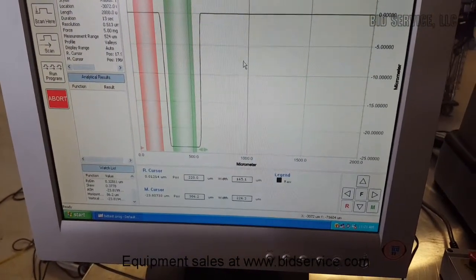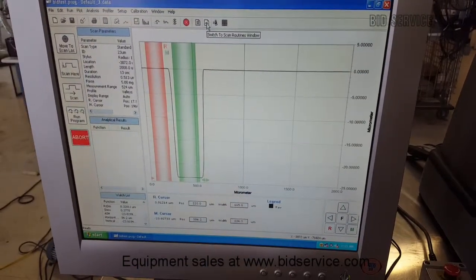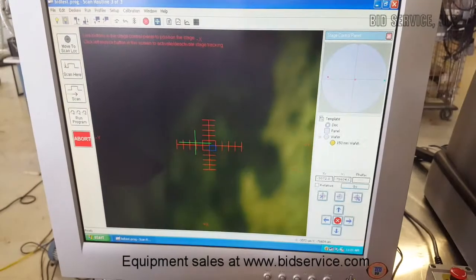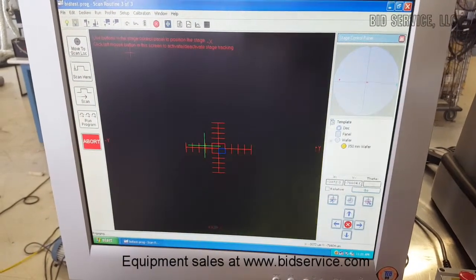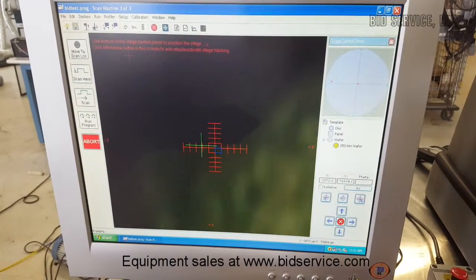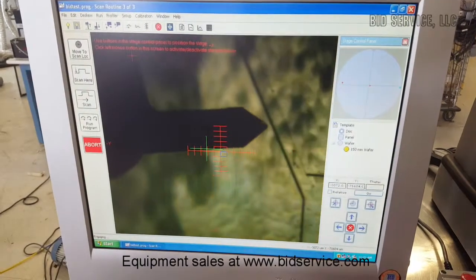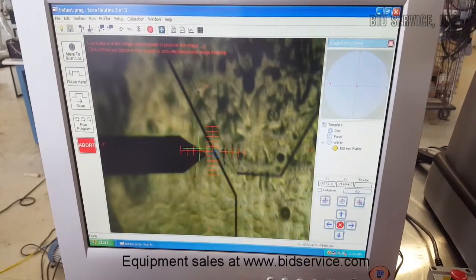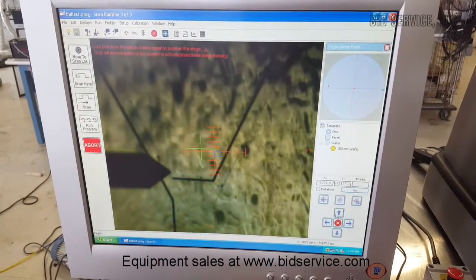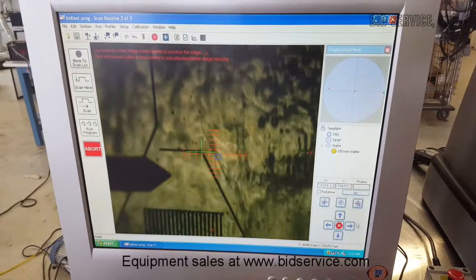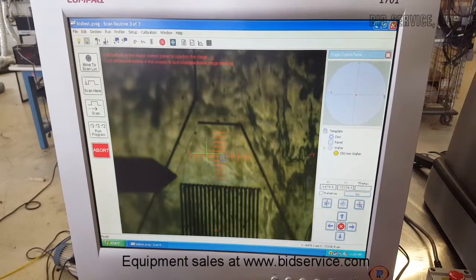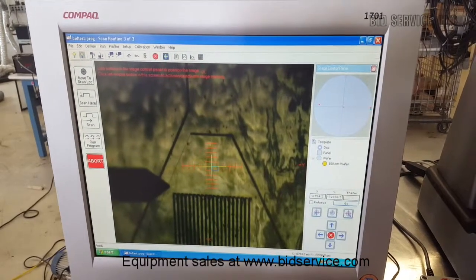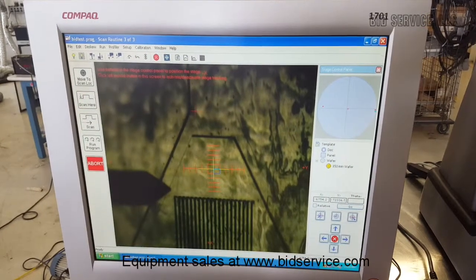So this was an example of an automated program. As I said before, you can run single programs, single scan routines. To do that, you would just position the wafer — your sample. You can update this, and then you can just say scan here, and it would perform a scan at that location.